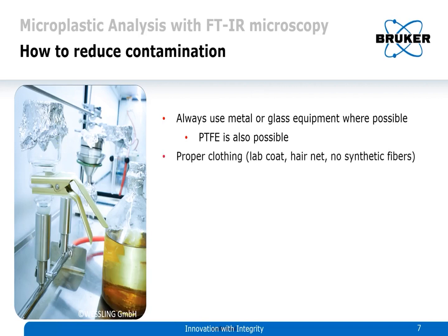Wear proper clothing in the lab. So a lab coat is important, wearing a hairnet, avoid synthetic fibers altogether to not contaminate your sample with microplastic. The use of filtered water, as we have mentioned before. And very important is the measurement of blind samples as reference.